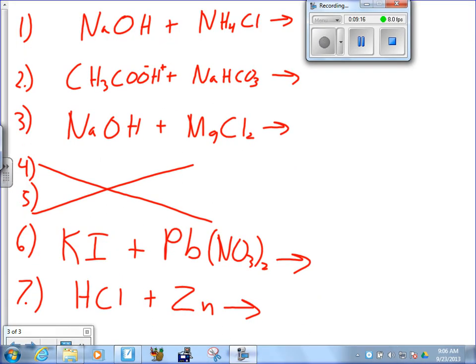All right, so quickly here, guys, while you're finishing up that prediction stuff. Signs of a chemical reaction are what? Color change. Precipitate being formed. Bubbles, which usually means what's been formed? What comes out of the bubbles? Oxygen is a gas. Okay, so a gas being evolved. Evidence of that can be bubbles. Doesn't have to be. All right, what's the other sign that a gas is evolved? Okay, not always, but heat is a sign of a temperature change.